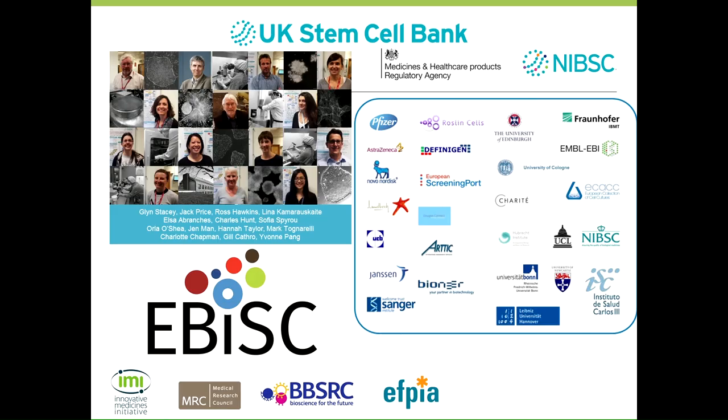No, because originally we were just running this assay just to check basic pluripotency, but once we started getting all the data back, we were like, oh, there's a huge amount going on here. And once we started to look at it, then we started seeing things and answering all these questions. So that wasn't the original plan, but I know what you're saying in terms of that. That is very interesting. I said, it's only 24 genes we're looking at here in terms of all these things.